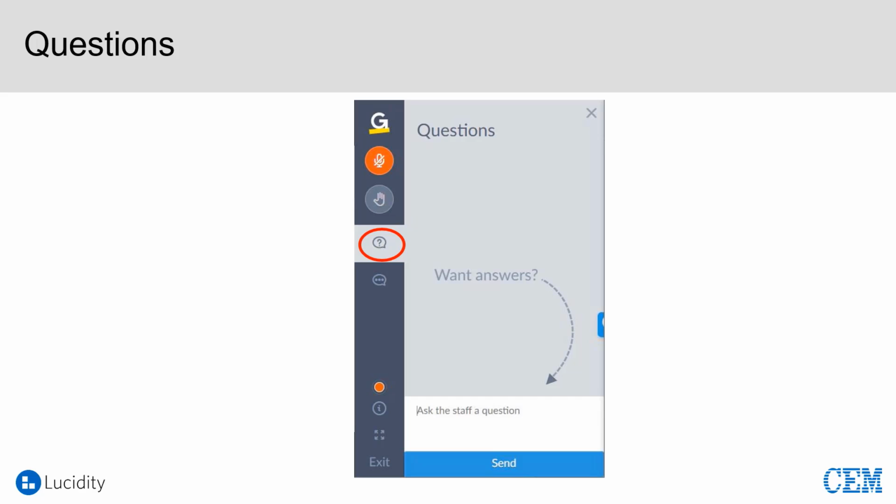Gotcha. So this is more of an application question: when you change carrier gases, is the offset standard from gas to gas or independent of sample, or is it sample and gas specific?